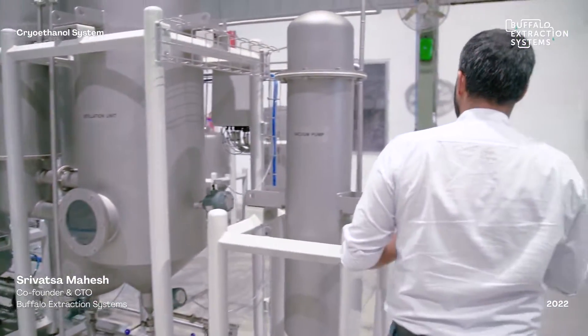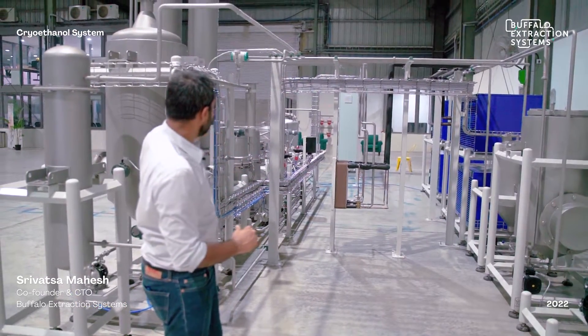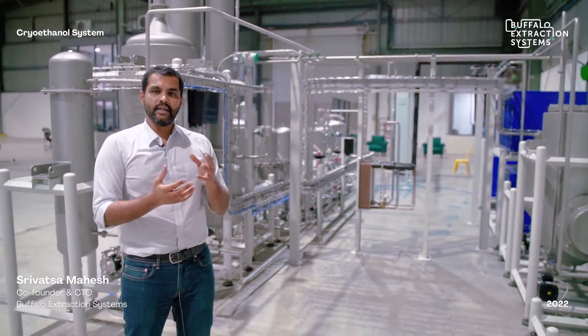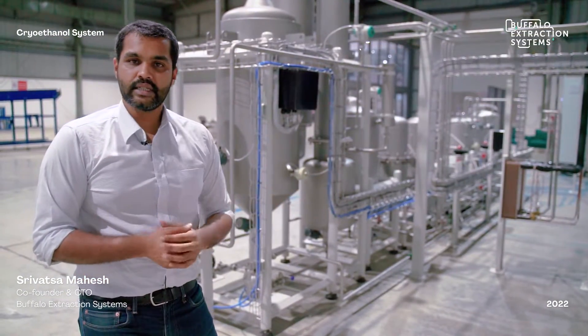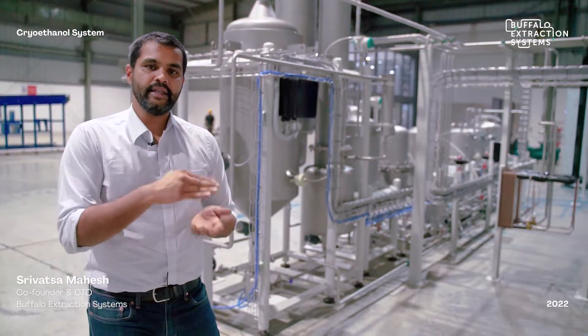At the back is a complete utility skid that ensures all process equipment operates at its desired temperatures and pressures. The typical utilities include condensing units for chilling the ethanol, chilling the jackets, and condensing ethanol in the recovery unit, plus an overall vacuum system with a vacuum pump and vacuum tank to pull down the boiling point of ethanol, and a heating skid to evaporate the ethanol and separate the oils.